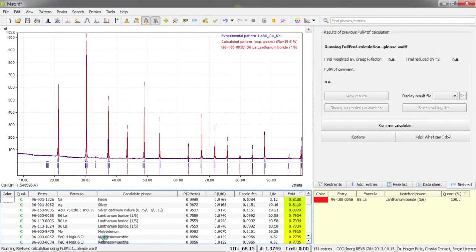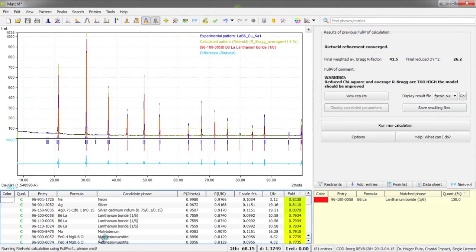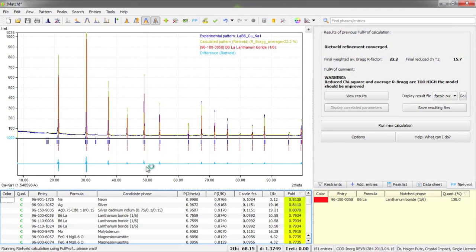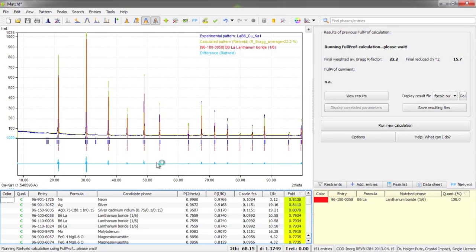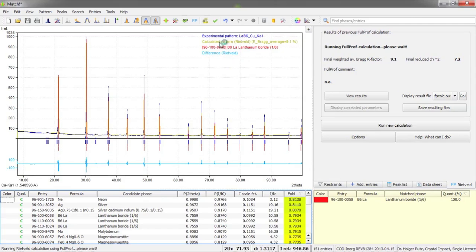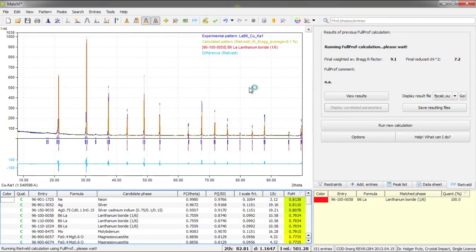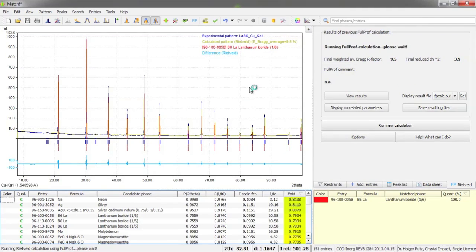Now full prof will be started in the background and process the calculation. Now we have some changes here in the diffraction pattern graphics. The difference plot is now displayed here as well as the calculated pattern from the Rietveld calculation so that we can see the progress of the calculation.